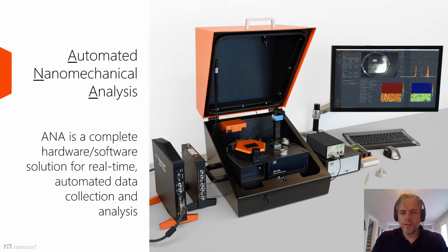So I've been saying automated nanomechanical analysis, and we call that ANA, A-N-A. What is ANA? Well, ANA is a complete hardware and software solution for real-time automated data collection and analysis.